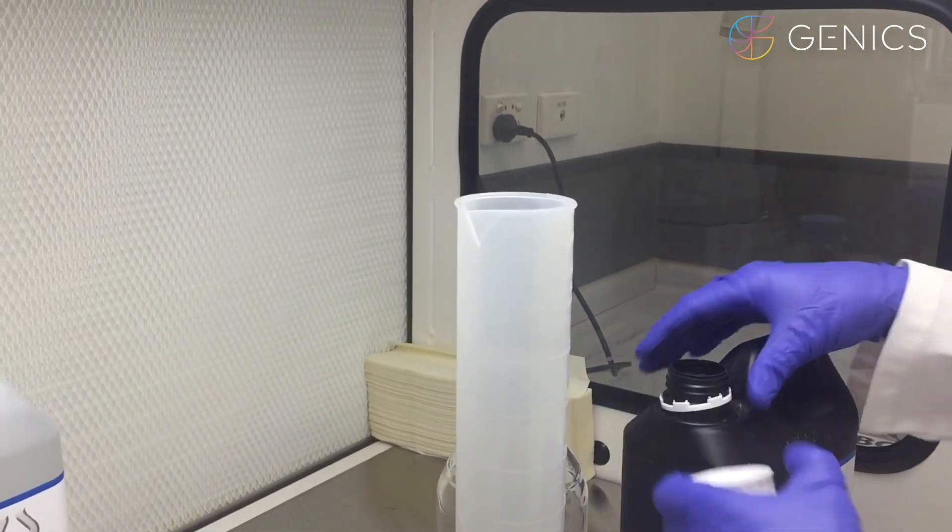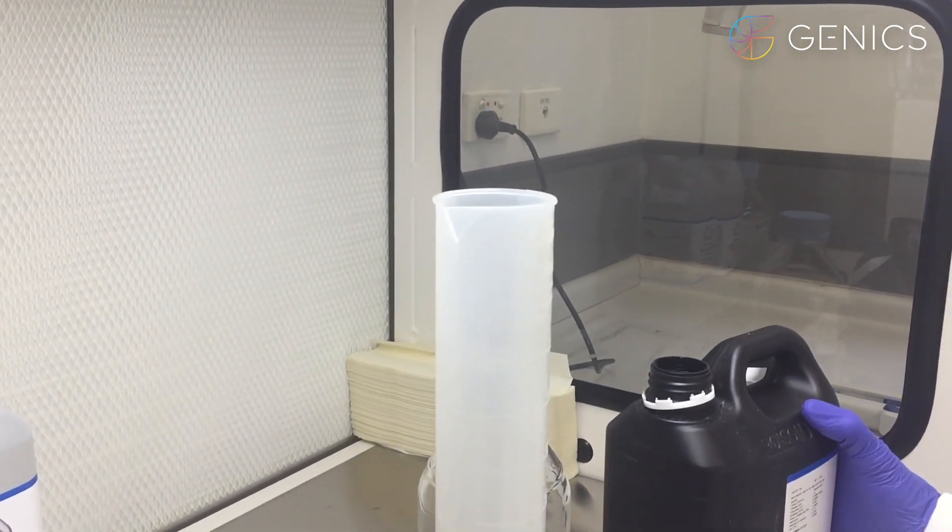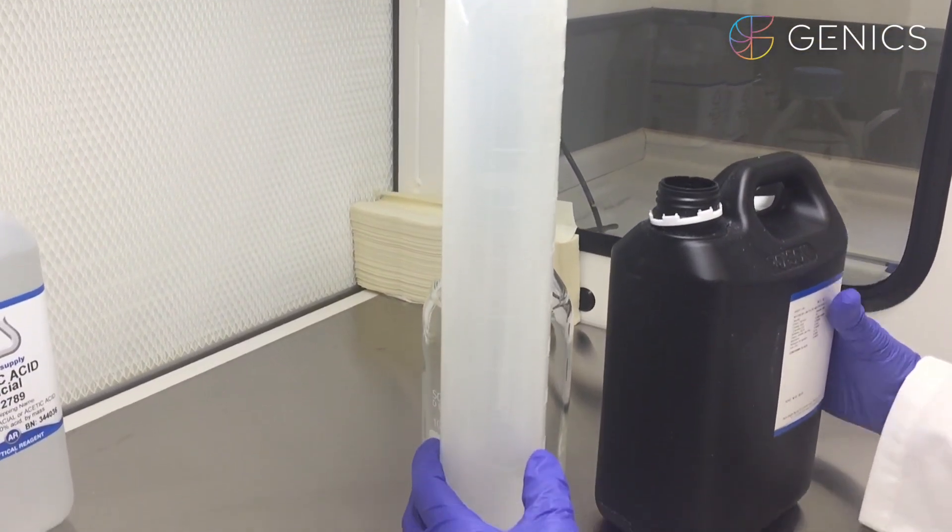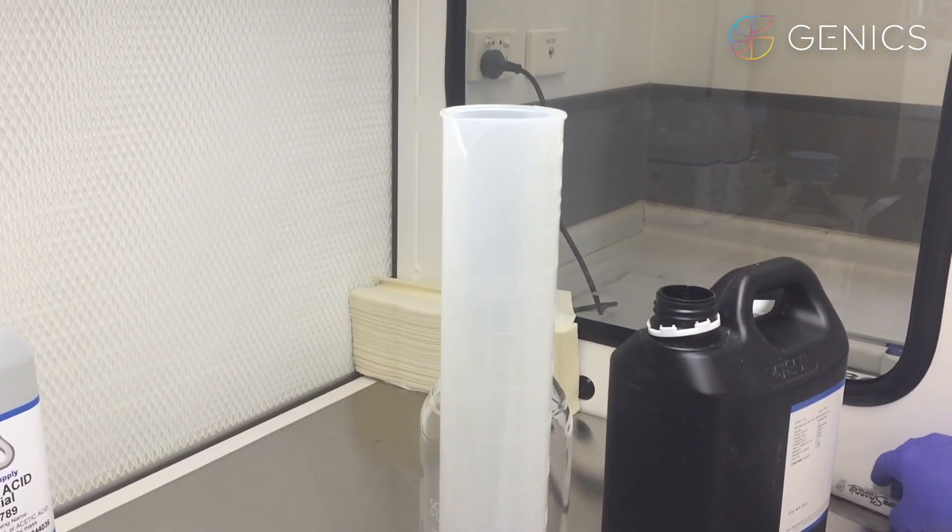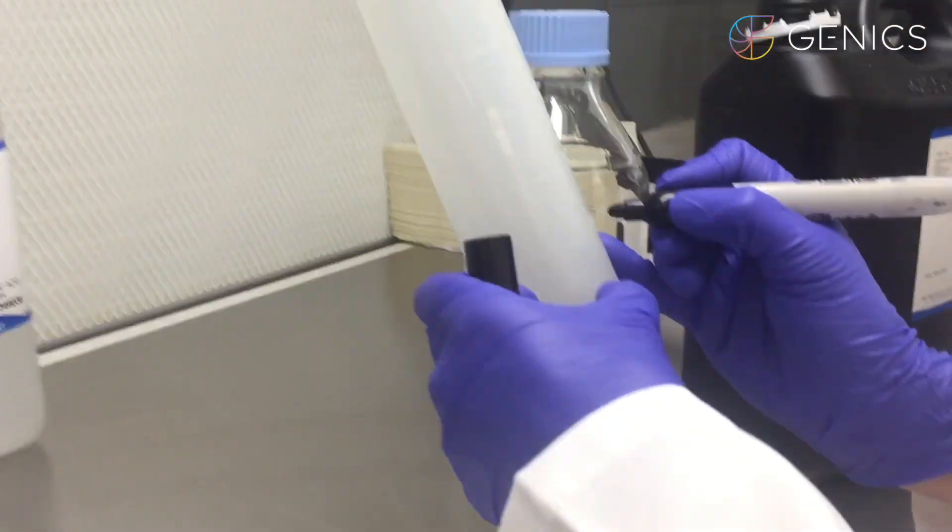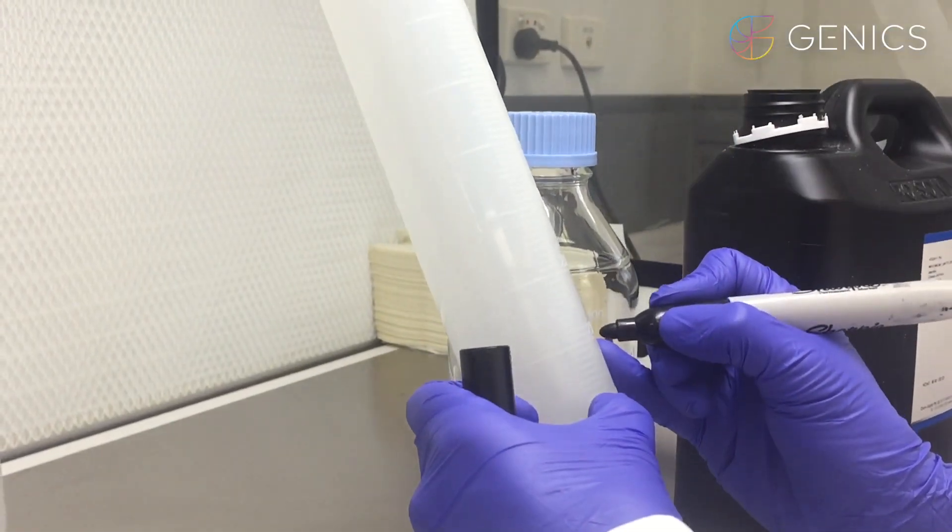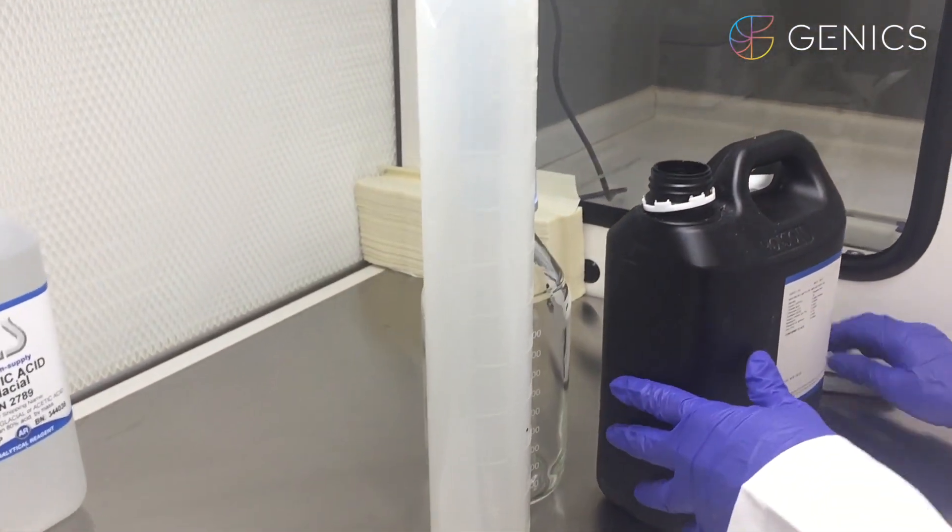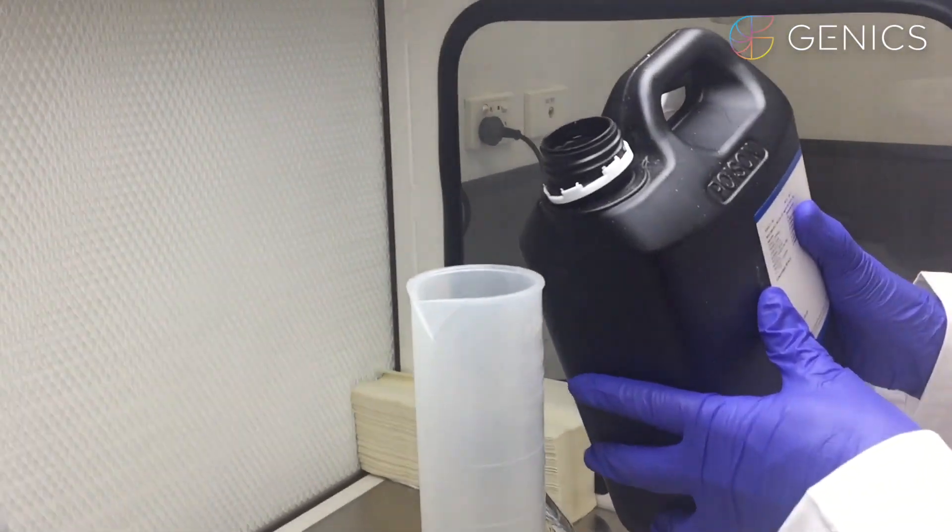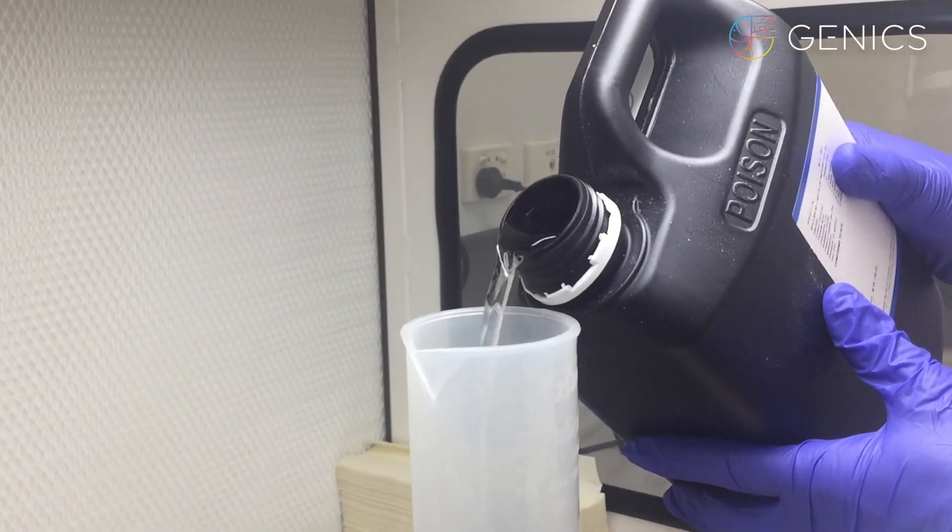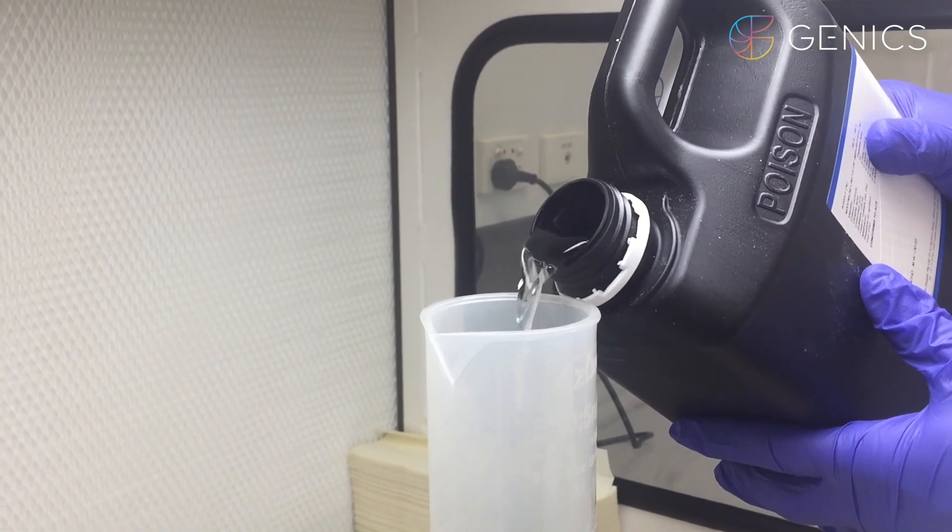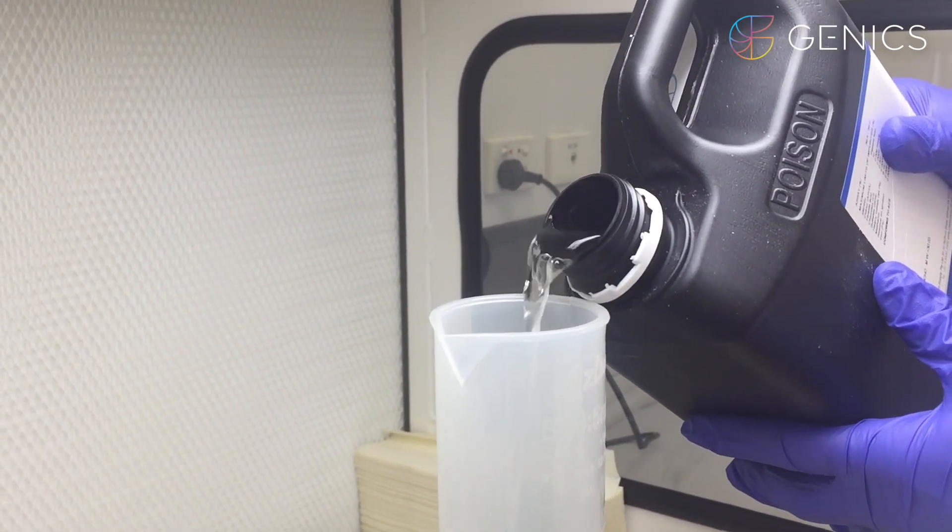It's very important to use safety equipment when pouring out these chemicals. So 220 mils will be here. I'm actually going to mark our measuring cylinder to make it easier.